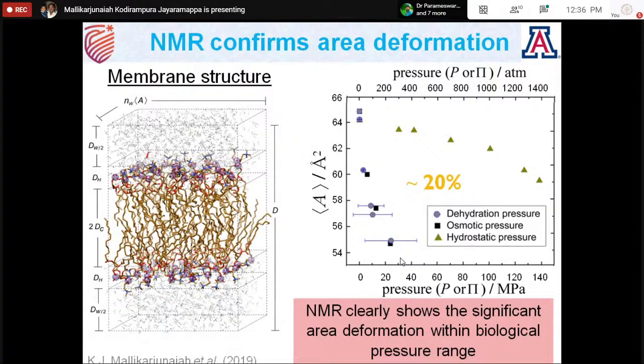And that modulus, whatever rigidity we get here, is correlated with the mechanosensitive property of the given membrane system. That is the physics part of it, one of the physical properties one can measure. Though our system is a biological system, we are getting material properties of the components of the lipid membranes.